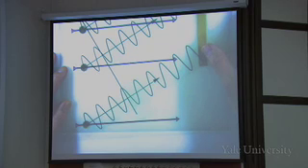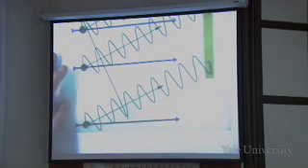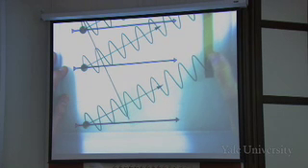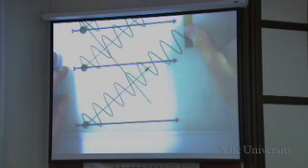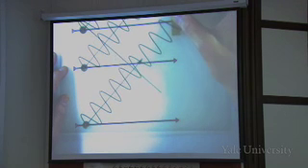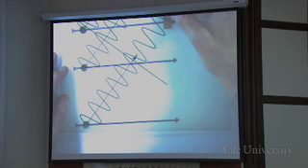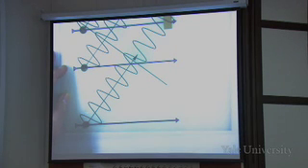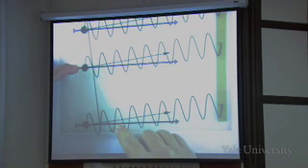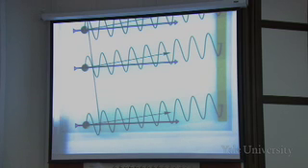And how about if we go to the fourth? If they were evenly spaced, what would you expect for the fourth? Very strong, right? So let's go to the fourth. 1, 2, 3, 4. What should it be? Really weak. And how about the fifth? That's precisely what she saw, right? Weak, strong, strong, very weak, strong. So this is how much it's offset from the center in order to get that sequence of intensities. Everybody with me on this? Okay.